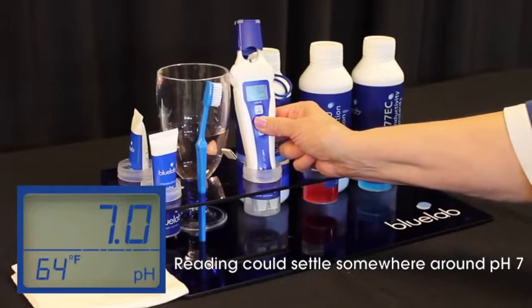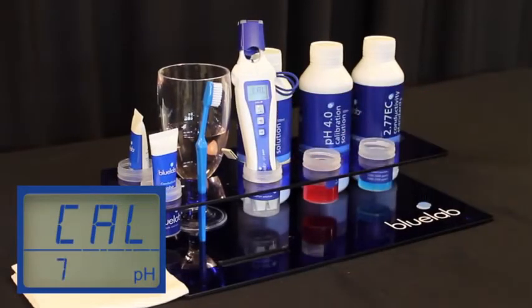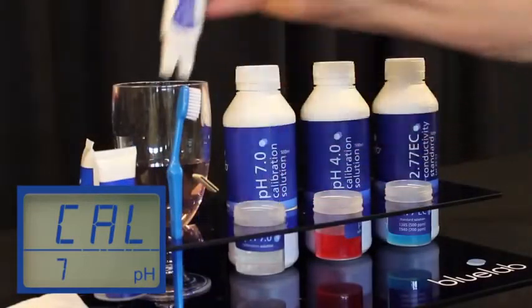With the pen in the 7.0 solution, hold the cal button down until it says CAL on the screen. Then remove and rinse in clean tap water.